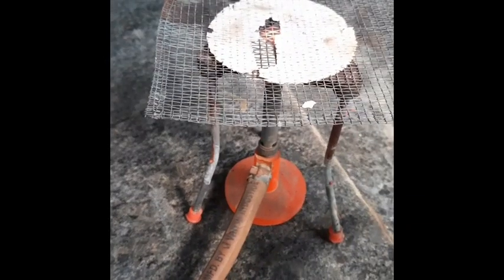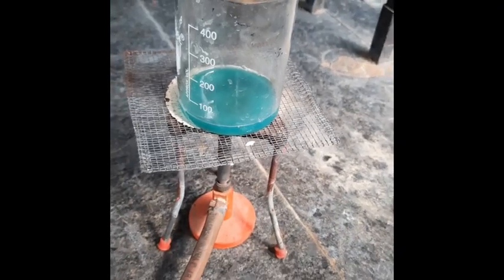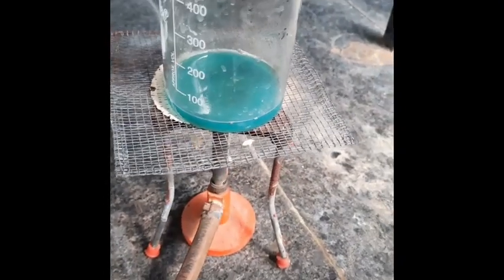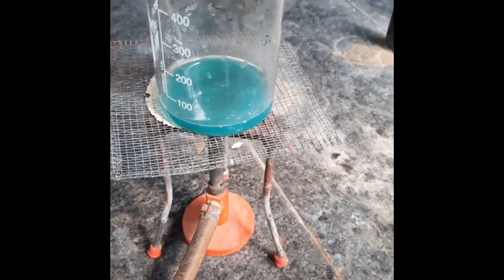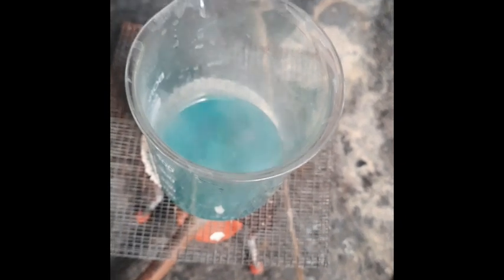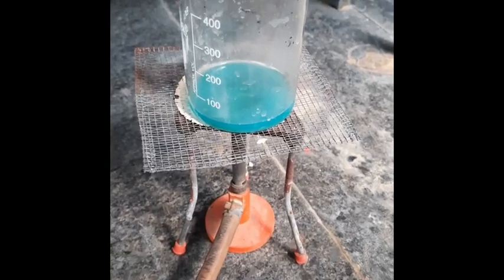This is the wire gauze and the burner is on now. Place the wire gauze and keep this beaker on it till the ore dissolves completely. Now you can see the color changes to blue. You have to heat till it dissolves completely. Now you can see the ore sample is completely dissolved. Now stop the heating, turn off the burner, and keep it for cooling. You have to wait till it cools.